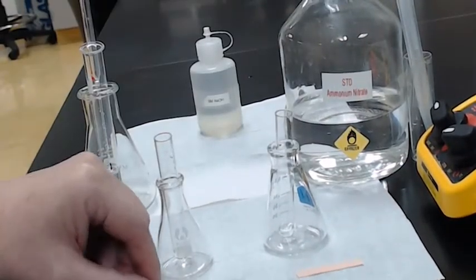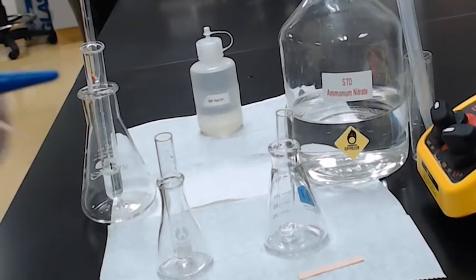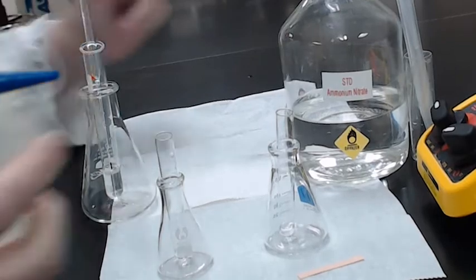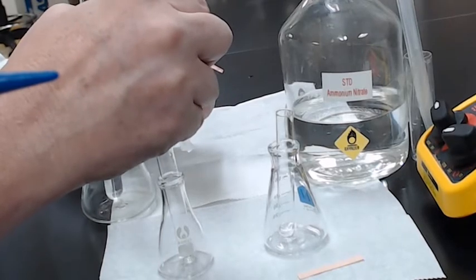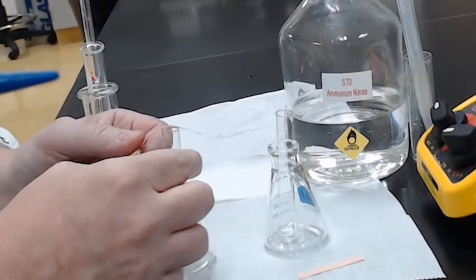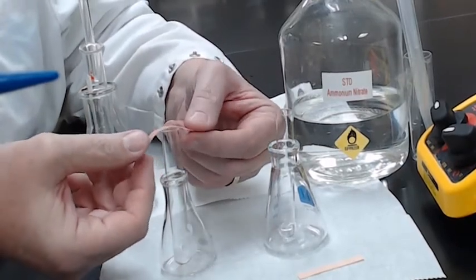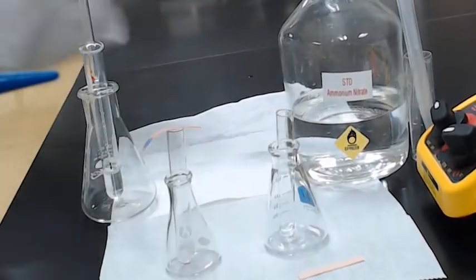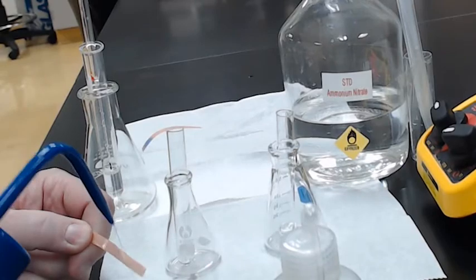Now I'm going to pre-prepare the litmus paper. You need a pink litmus paper, moist with a little bit of pure water. Then we're going to add 5 drops of the sodium hydroxide into the mixture. If there are ammonium ions present, they should turn into a gas similar to what we would smell, and then float up to the top of this pink paper. You can see it turned blue just from me touching it, so that doesn't count. It has to turn blue in the circle. Likewise, we're going to do the same with the known. We're going to moisten it.